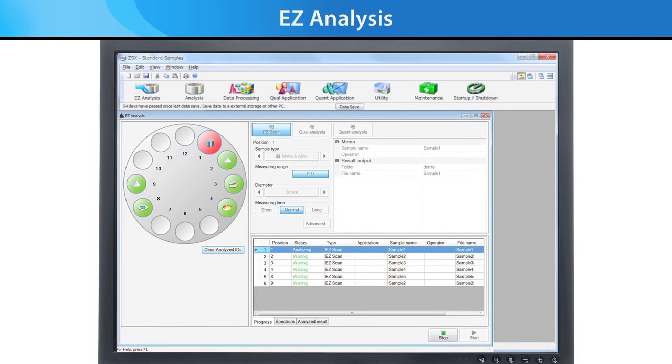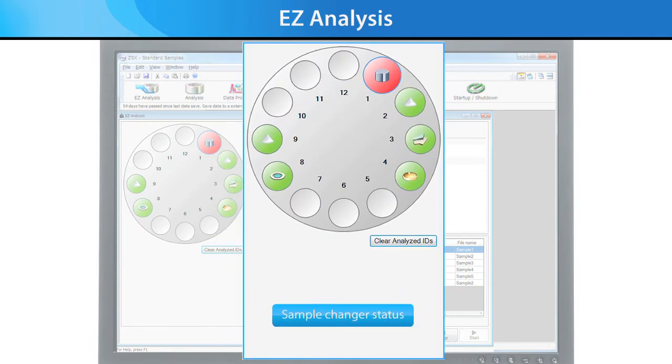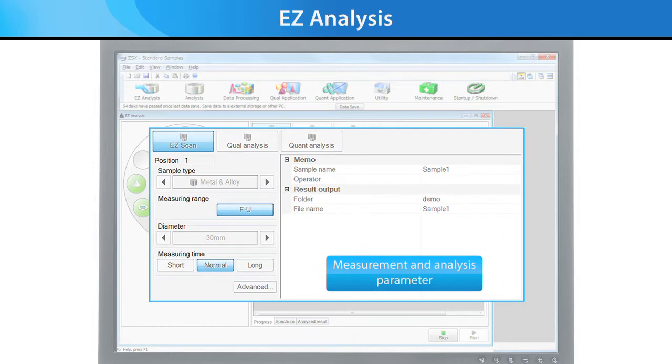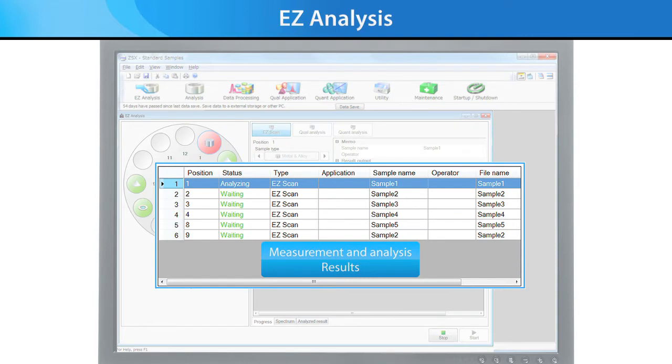Easy Analysis is a new feature that makes everyday routine operations so much simpler. One interface contains everything you need to know about the status of your samples, what your data measurement parameters are, what your data analysis parameters are, and a running output of your results — all in one easy-to-understand interface.